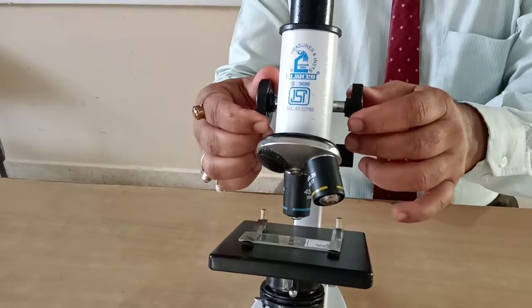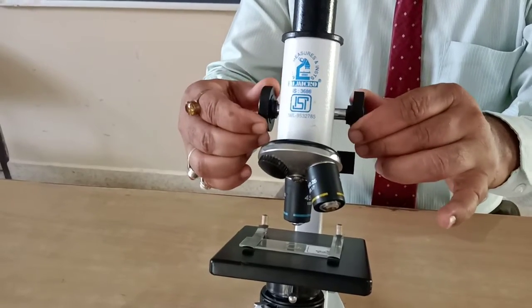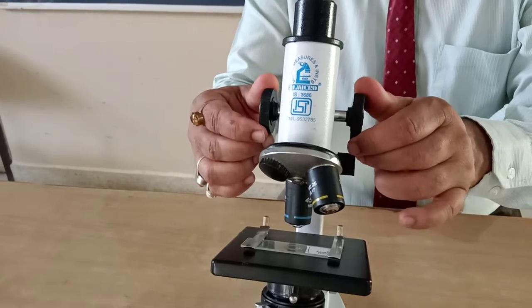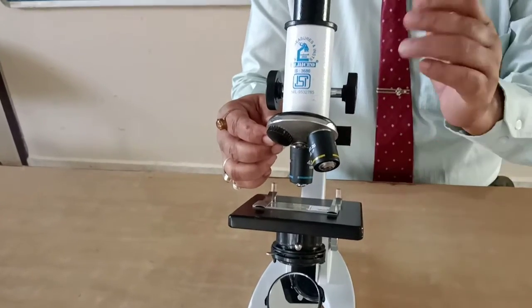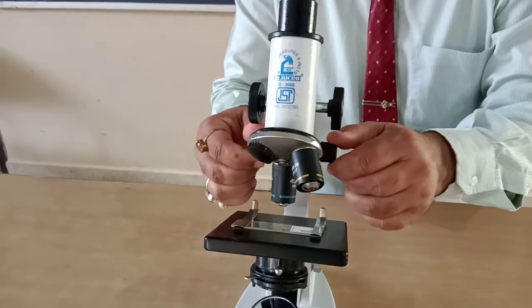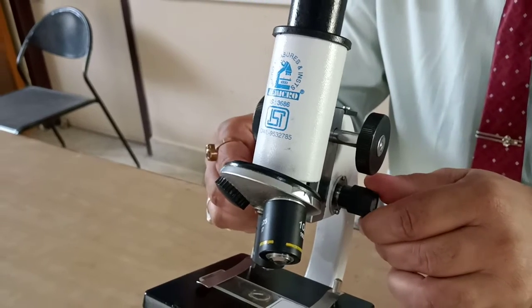First of all, we have to set the slide using this broad adjustment screw. Once it has been set, we have to stop it. For more clarity, for fine tuning, we have to use the fine adjustment screw.